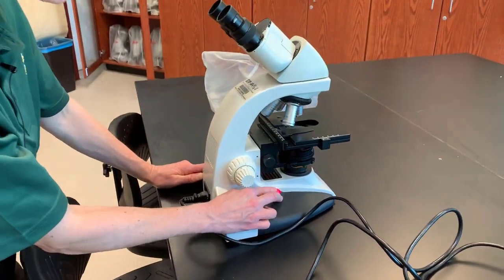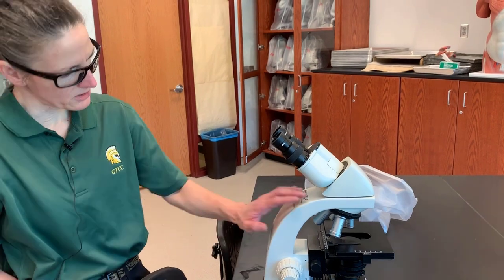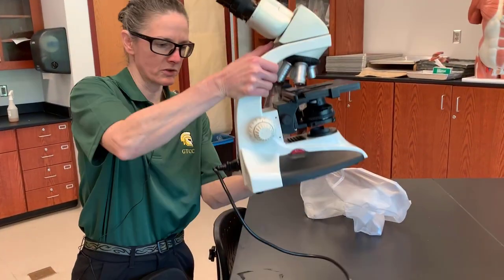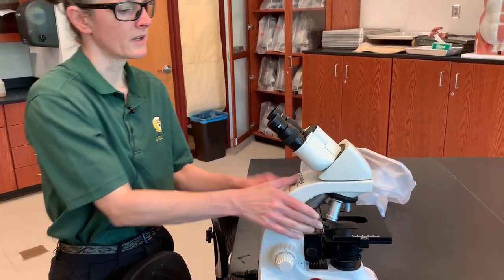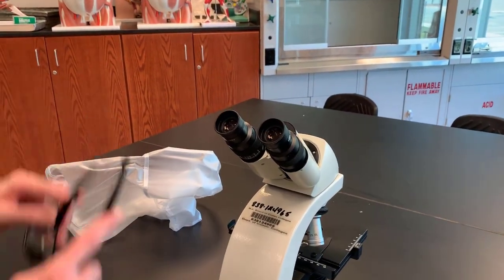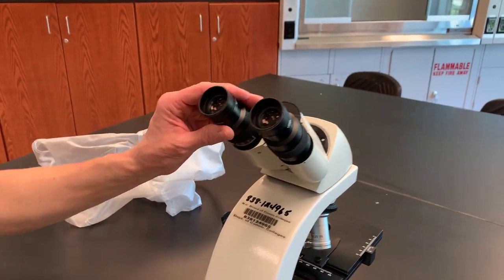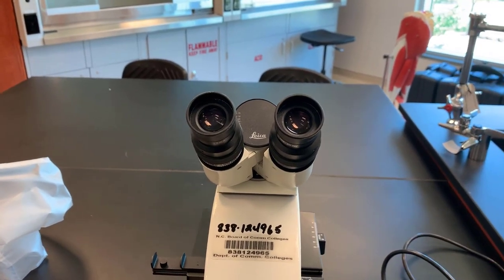You will see that we have several parts of the microscope here. In addition to the arm, which is the part that we carry it by, and the base, which is the part that it sits on, we have several lenses. The first set of lenses we're going to look at are called ocular lenses. These are the ones that you will look through with your eyes. Ocular means eye, so these are the ocular lenses.